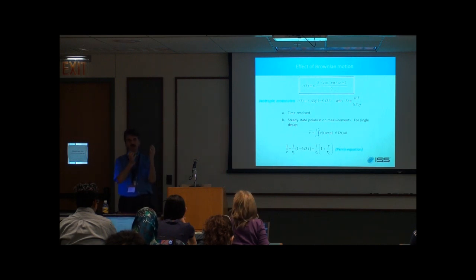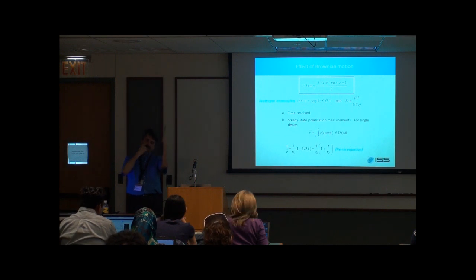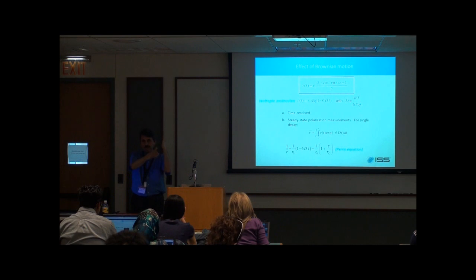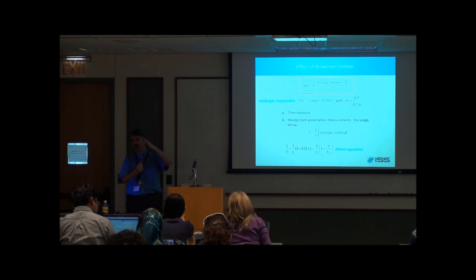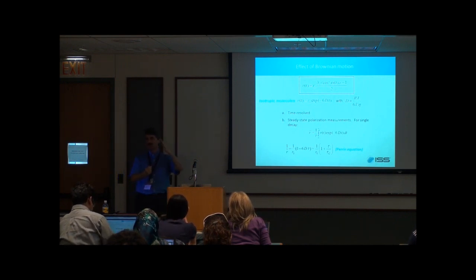So once the molecule absorbs some light and has a moment that is parallel to the excitation field, it gets in collisions with other molecules, and during the lifetime it might rotate. And so now we measure a different value of the polarization.